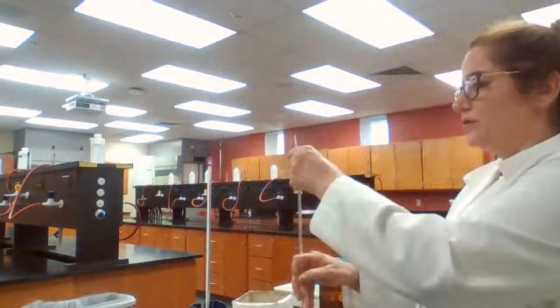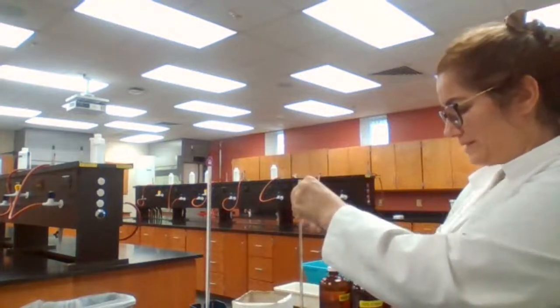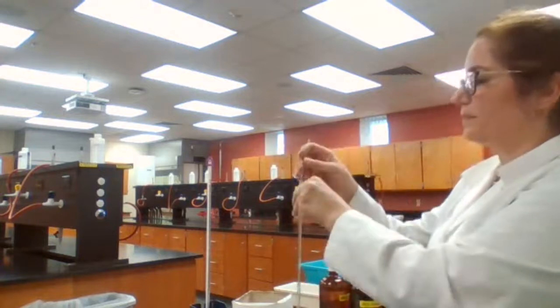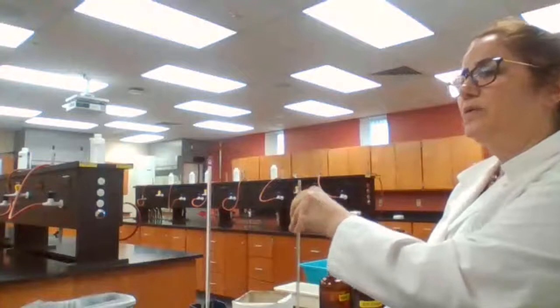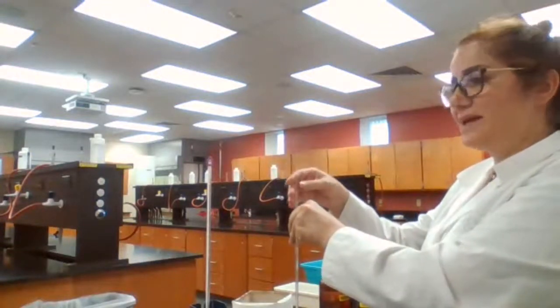And while I'm waiting for the naphthalene to melt, I'm preparing my unknown. So for melting point, the unknown letter is the letter C.